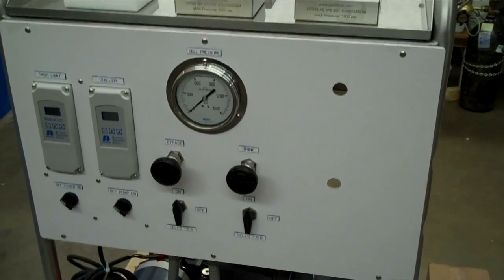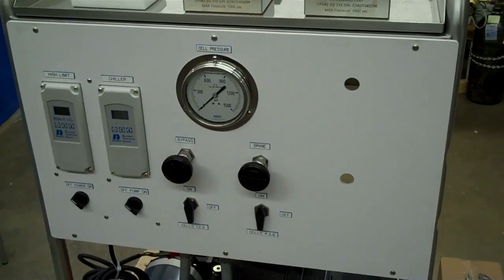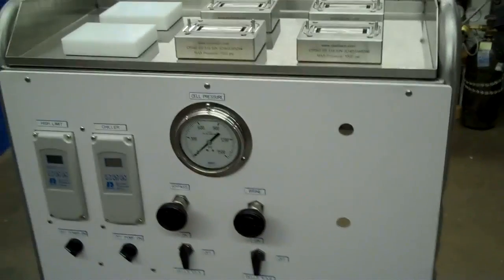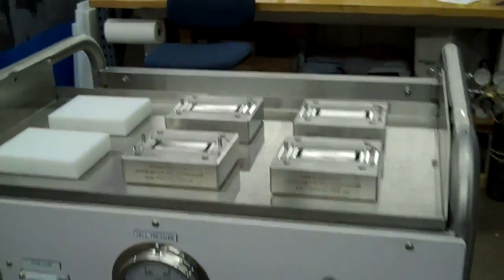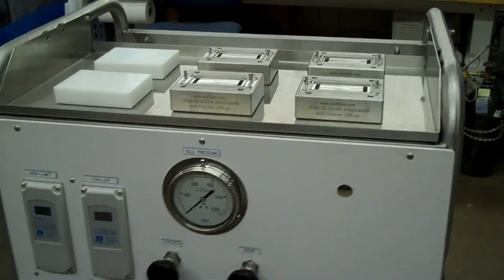Here is the front of the Stirlitec standard bench unit with four stainless steel cells on the top. It's going to run a total of six cells and run two separate lines with it.